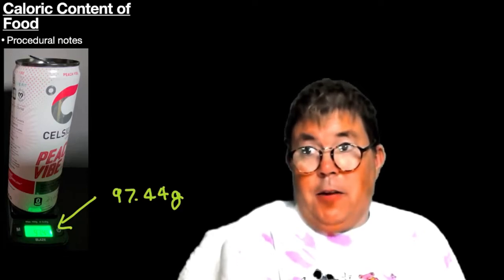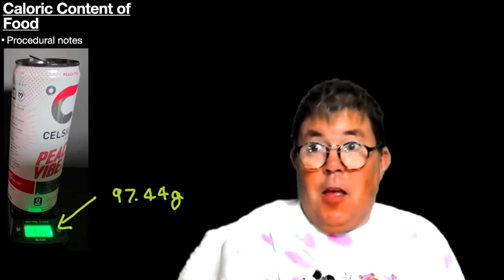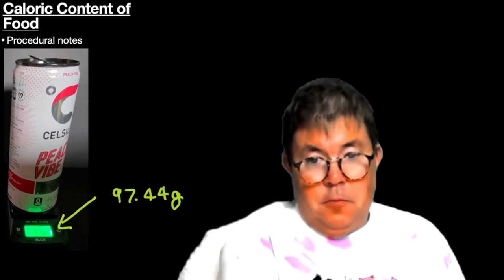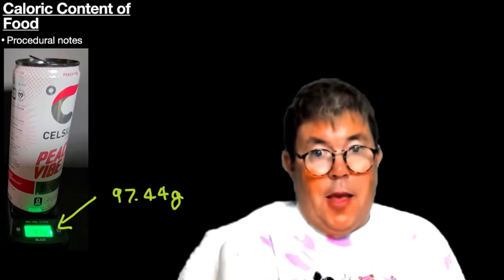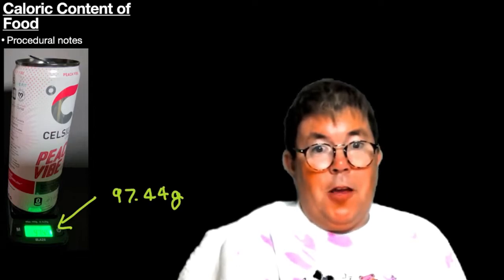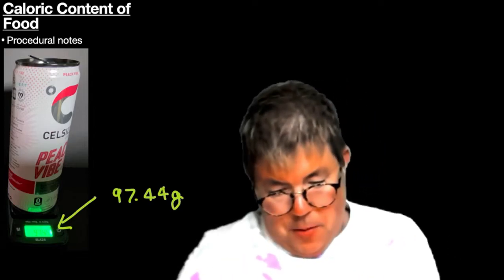We are not trying to heat the air inside the can, but rather we want to heat the water inside the can. So make sure we use approximately 100 grams of water. In this case, we are just under so that we can read the weight on the balance.